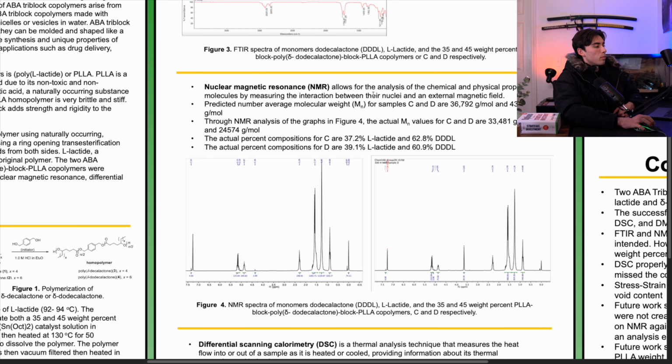So next we have NMR, which is nuclear magnetic resonance. This basically allows for the analysis of chemical and physical properties of molecules by measuring their interaction between nuclei and an external magnetic field.